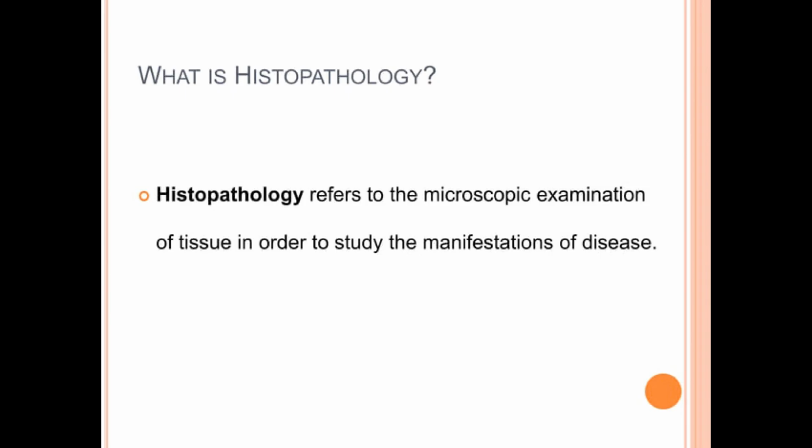Imagine histopathology as solving a puzzle. Each tissue sample provides small clues, and by studying it in detail, the pathologist uncovers the bigger picture of what is happening inside the body.